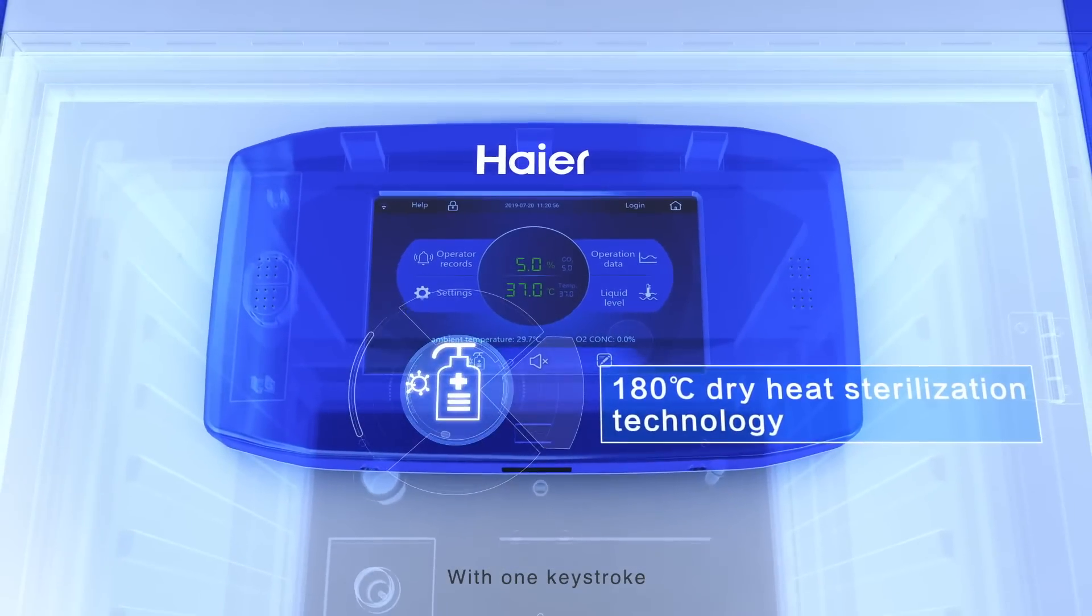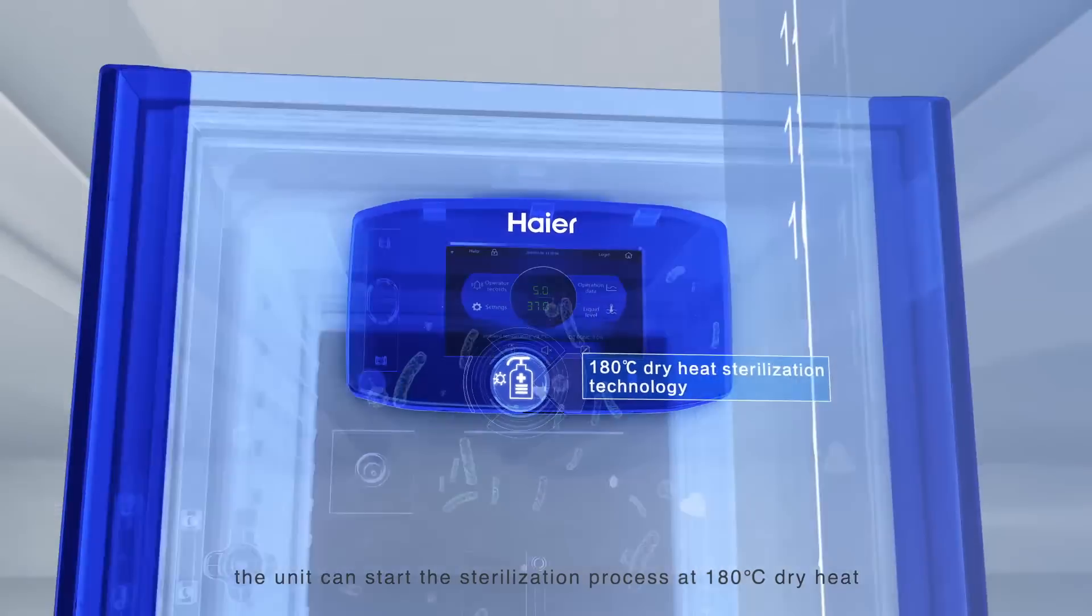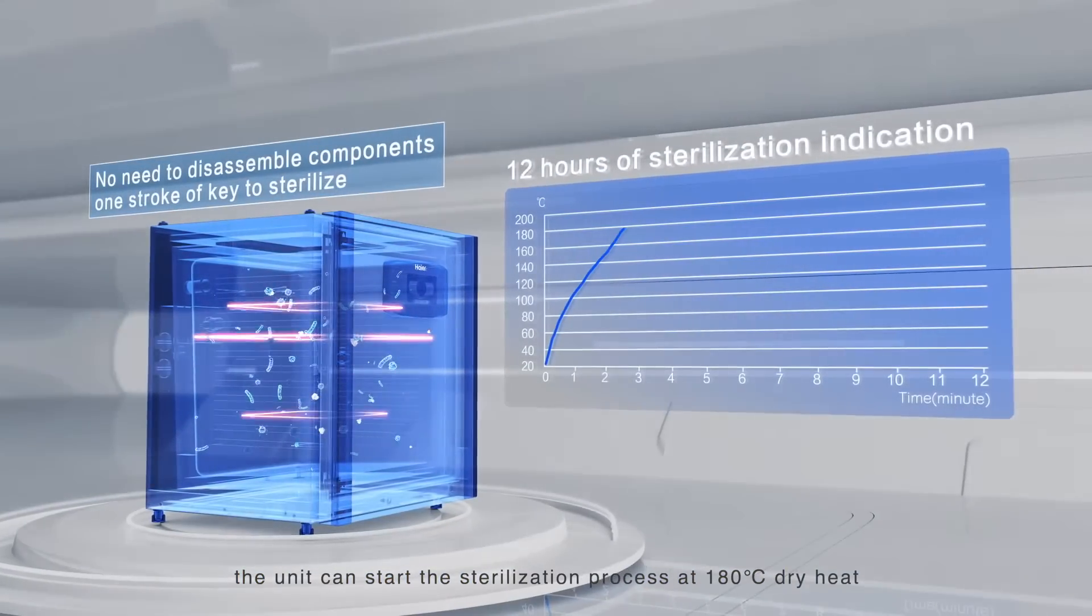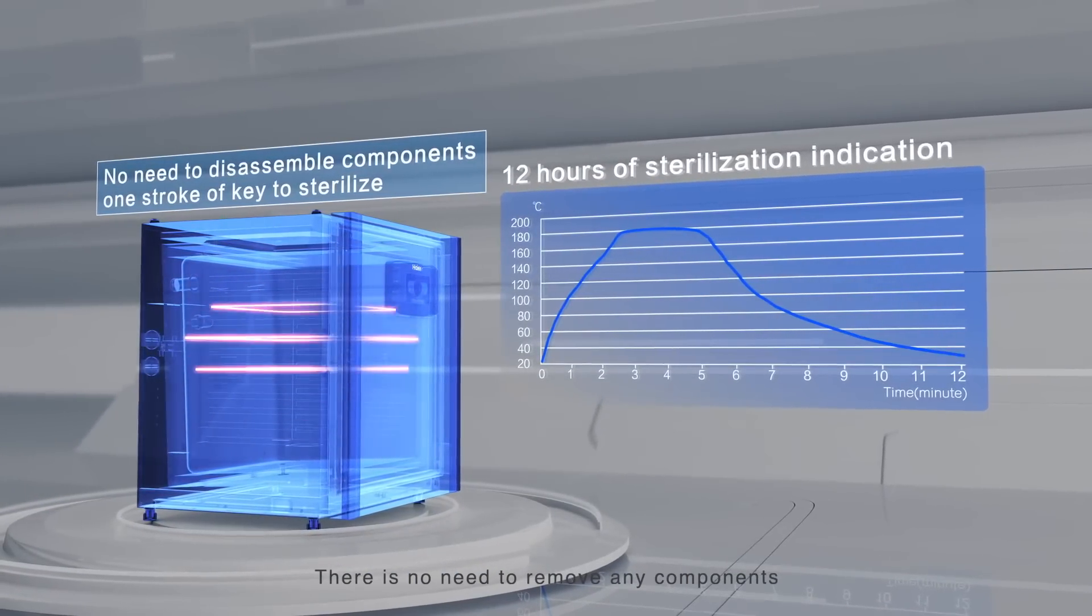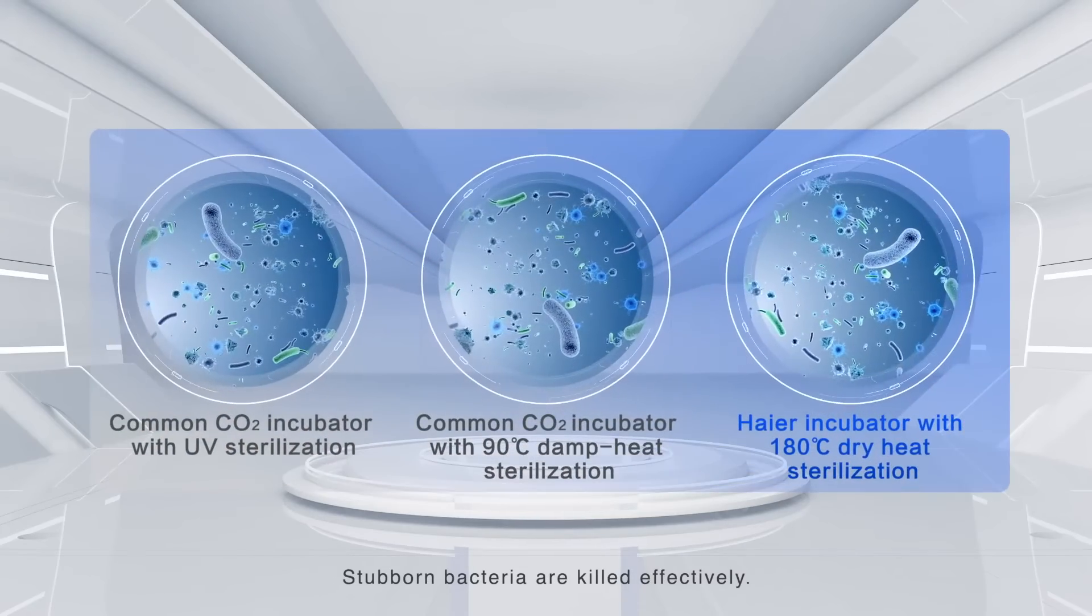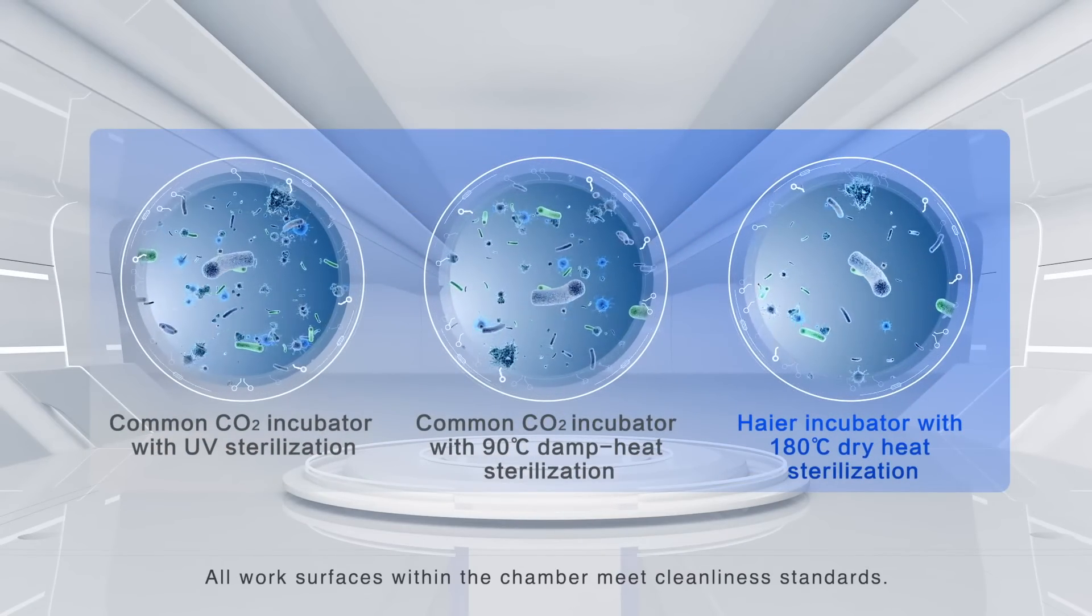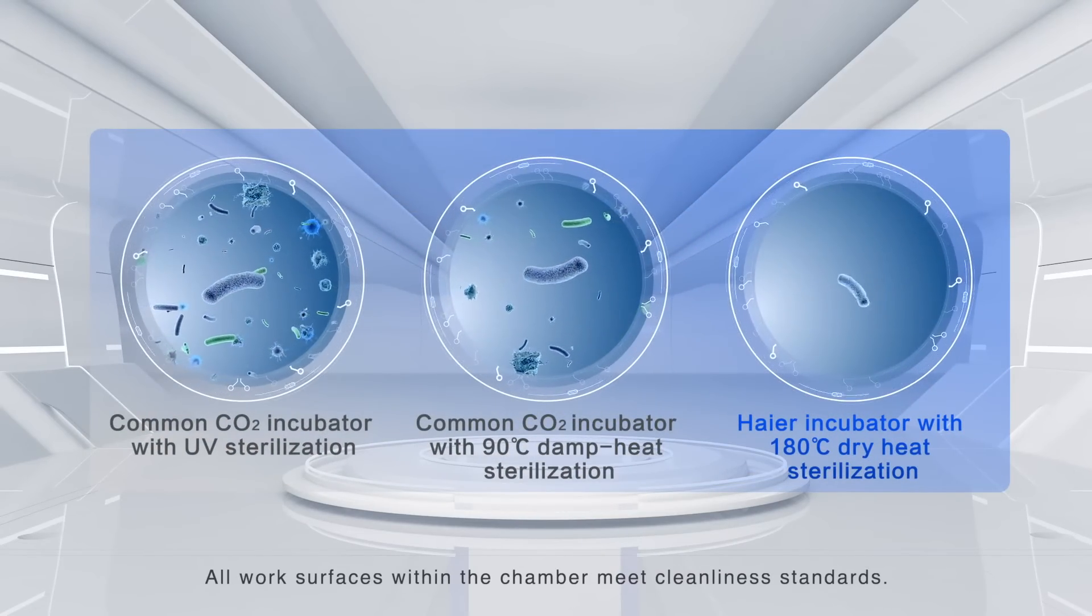With one keystroke, the unit can start the sterilization process at 180 degree Celsius dry heat. There is no need to remove any components. Stubborn bacteria are killed effectively. All work surfaces within the chamber meet cleanliness standards.